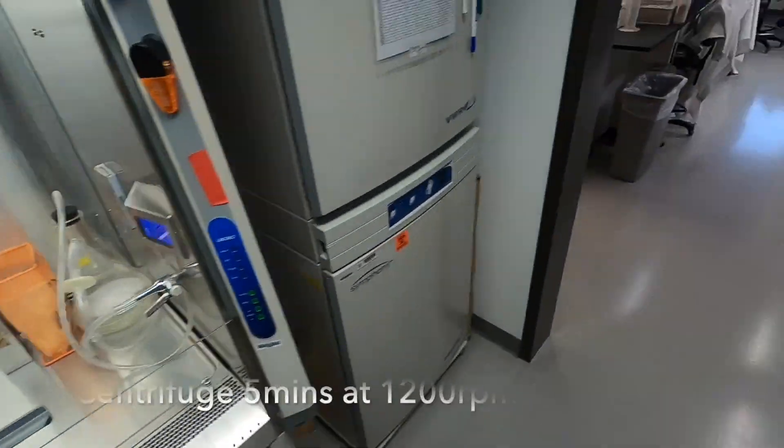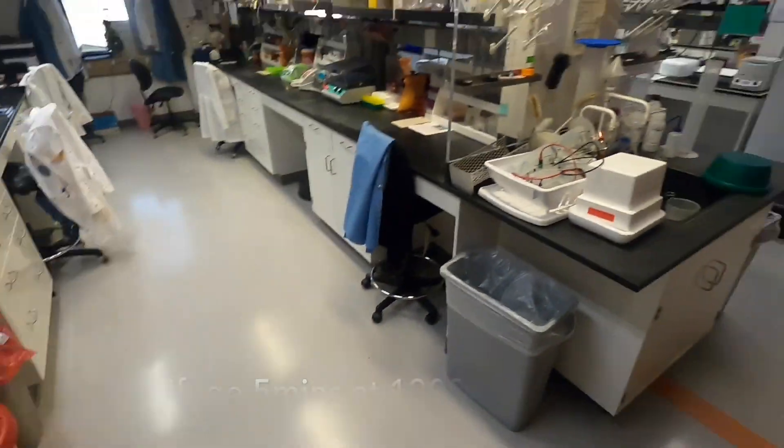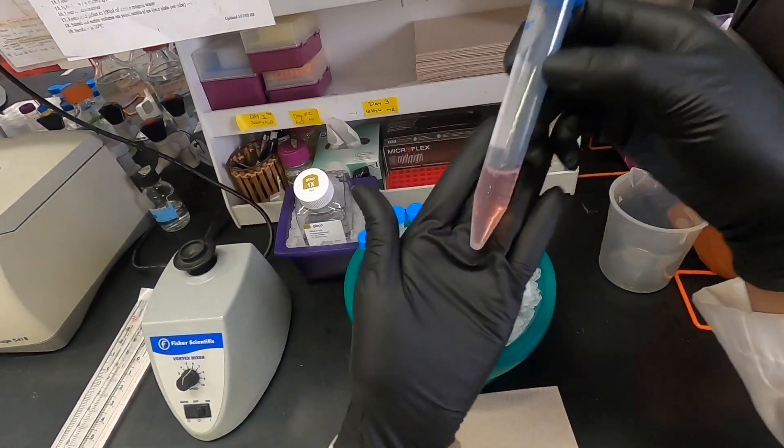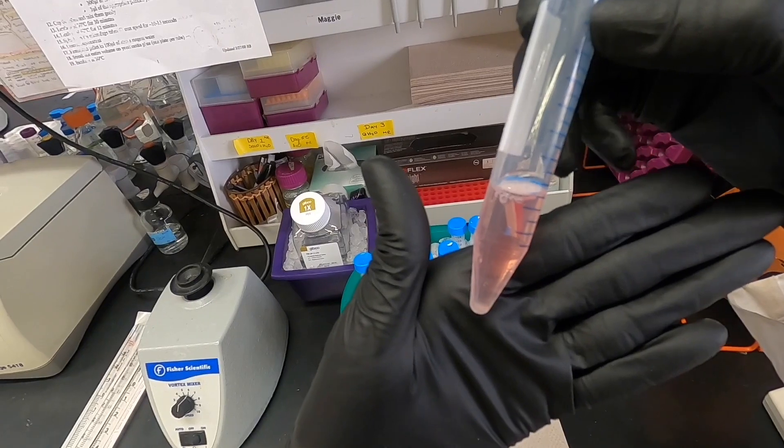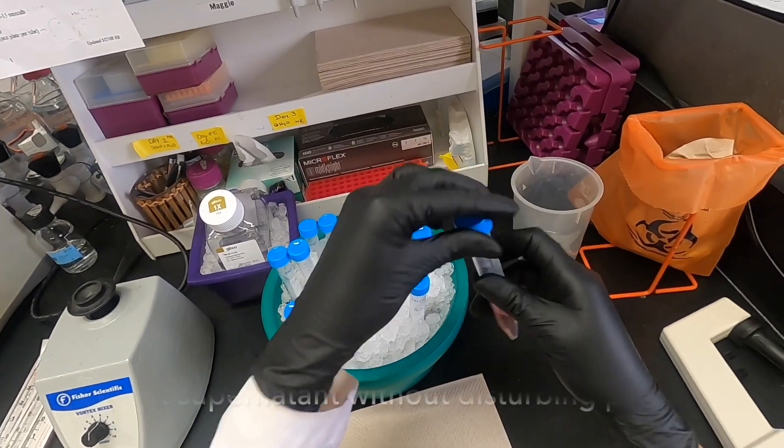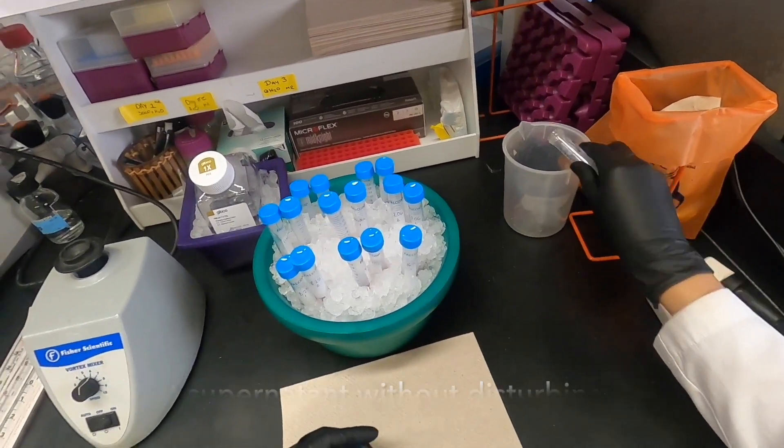Once all the wells have been transferred to tubes, we will centrifuge cells for 5 minutes at 1200 RPM. After the cells finish centrifuging, you can see there is a pellet at the bottom of the tube. Now we want to discard the supernatant after verifying that a cell pellet has formed.